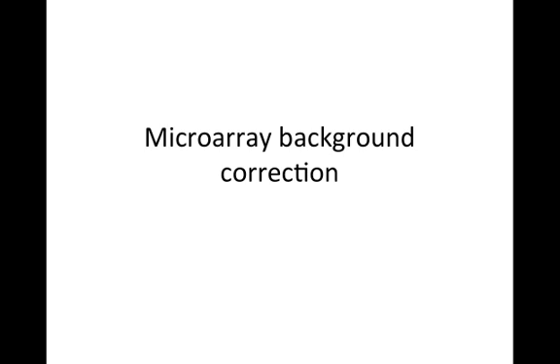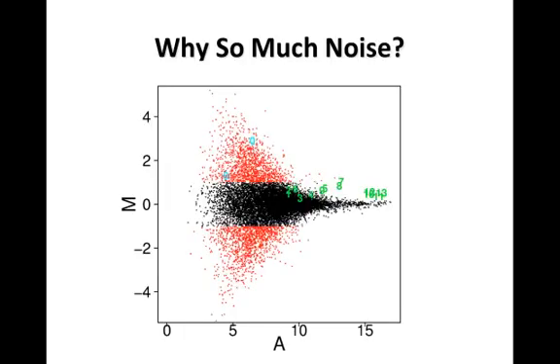Okay, today we're talking about microarray background correction. We're going to focus on the Affymetrix platform, although some of the issues we're talking about today apply to other platforms as well. Alright, we start with an MA plot, which we explained in the useful plots lecture earlier.